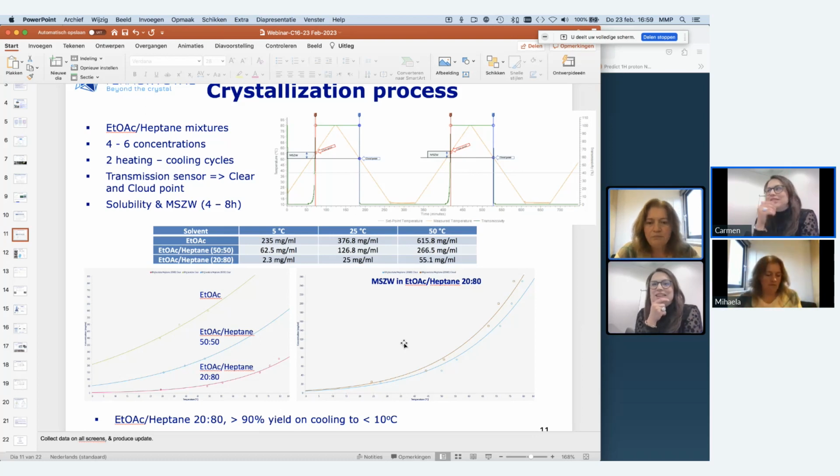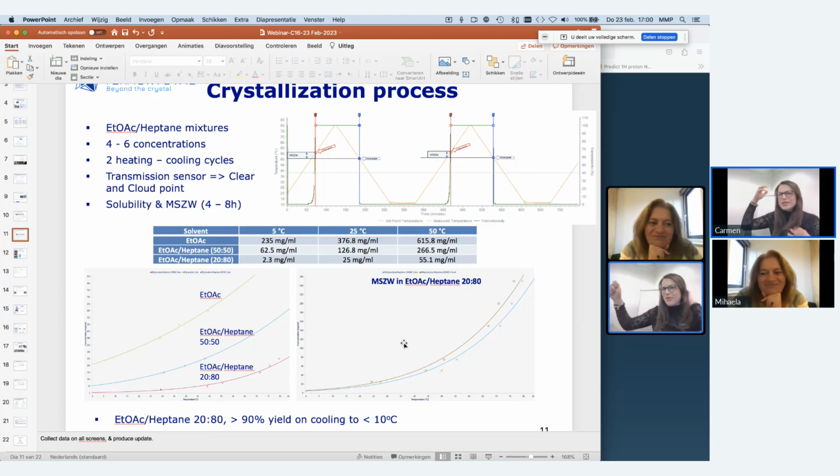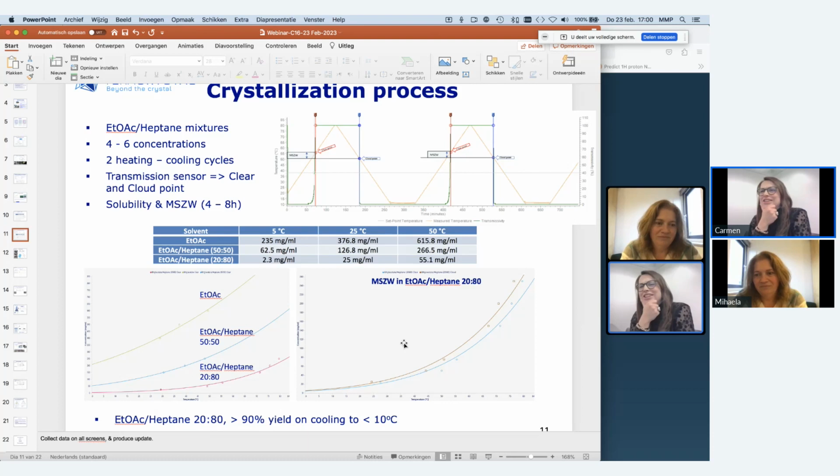Now, getting a bit nostalgic, I must be sincere. Thinking of the very first time I worked with the Crystal16 version 1, do you remember we had it with the glass plate and the software? The software was not that user friendly when you are making the program. I always had to think extra on how to make an experiment. If I missed something or didn't do it right, you had to redo everything and re-prepare your samples. We do not have these things now with the second version or even the third version. The third version comes with all these analysis tools, multi-analysis, that really help you. With a few clicks you get quite a lot of information out of it. So it's still nice to see this. Okay, I talk a lot.